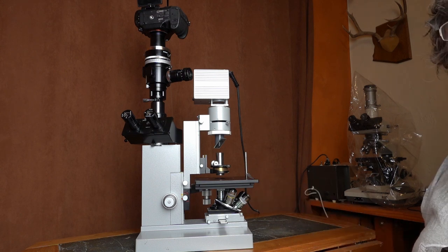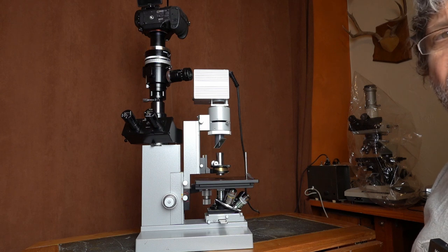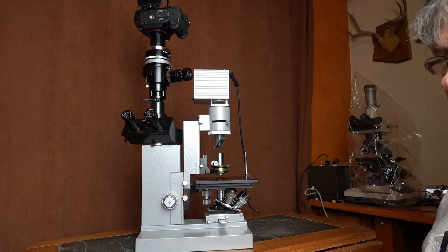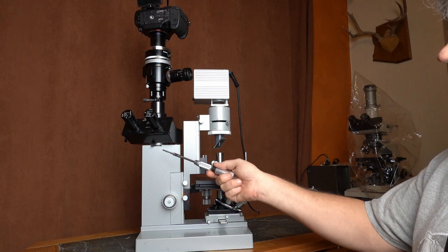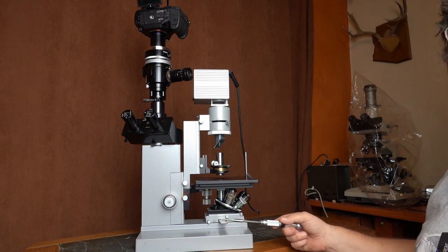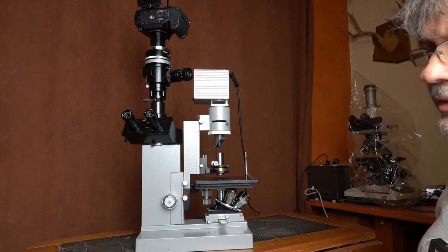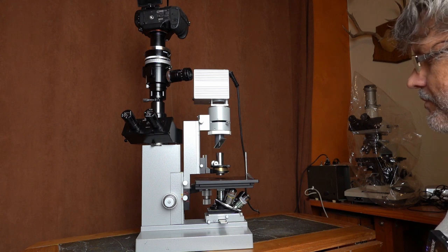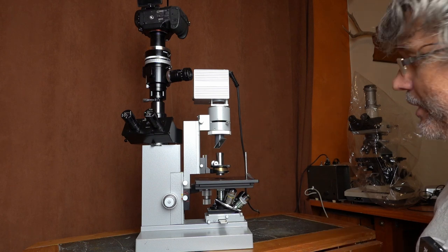This microscope is made for 170mm finite tube length objectives. Finite tube length objectives are older — you'll find them throughout the 60s, 70s, and 80s. These finite tube length objectives create an image directly that the eyepiece magnifies, whereas modern infinity corrected objectives do not make an image for the eyepiece — you need another lens downstream. We're talking about the old 170mm and 160mm finite tube length objectives, which are by far cheaper than infinity corrected ones.